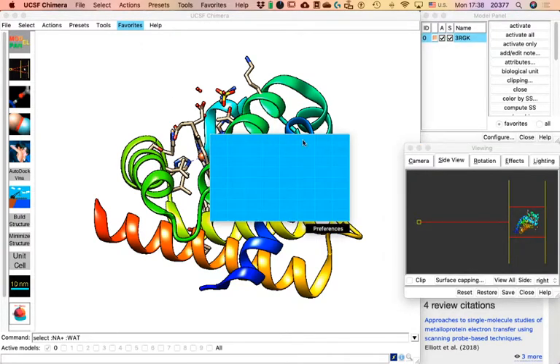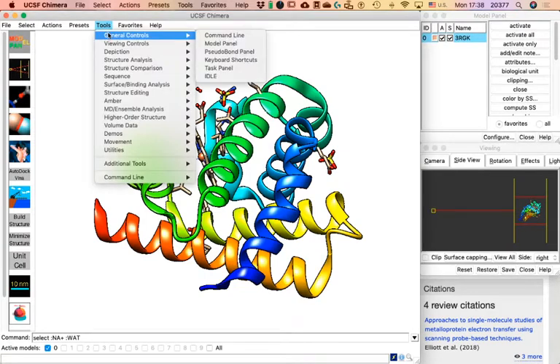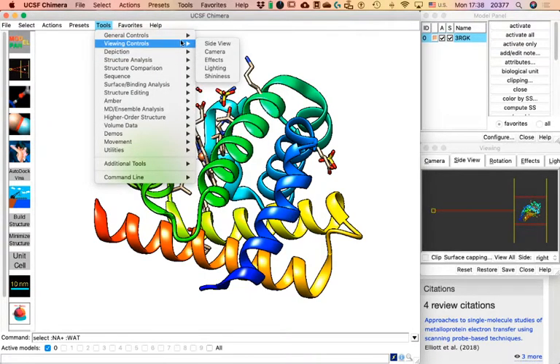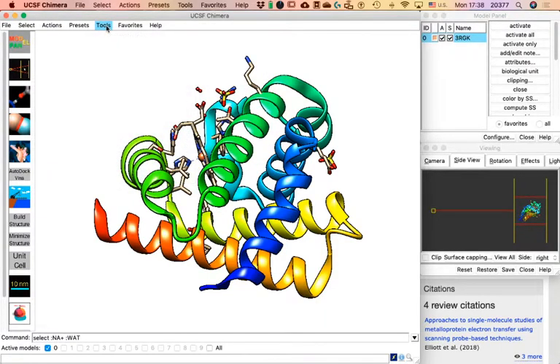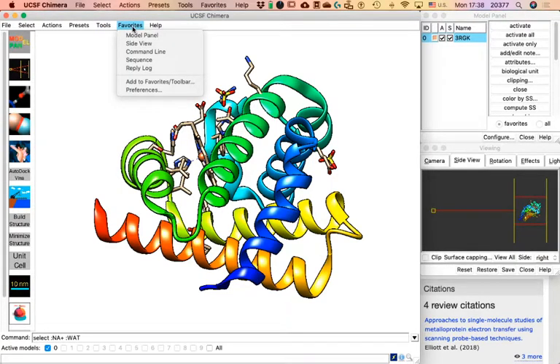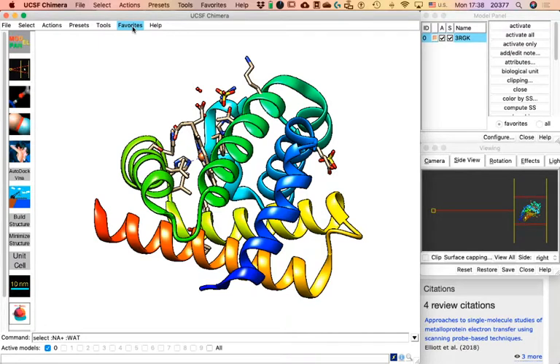Favorites also has Side View, which is located under Viewing Controls. All the menus in Viewing Controls correspond to tabs in that other menu. Favorites is where you put things you want with one click — nothing different from what you can find elsewhere. The icons on the left actually represent the same tools as in Favorites — the Model Panel, Side View, and others I added through 'Add to Favorites.' This lets me access them quickly without text labels.